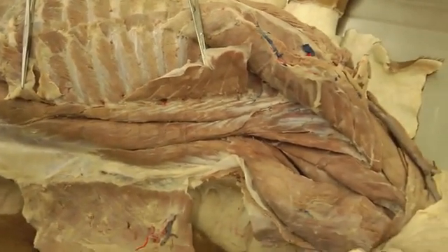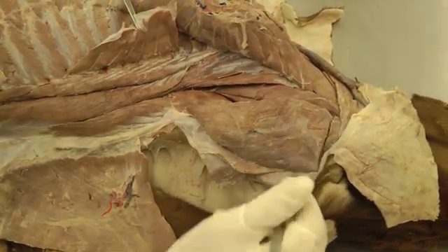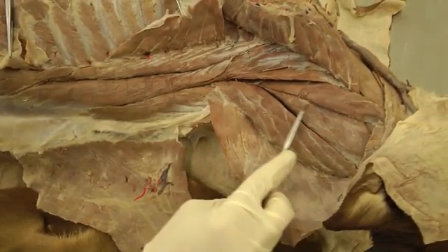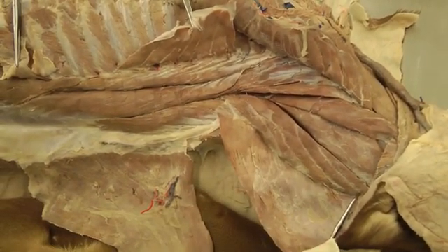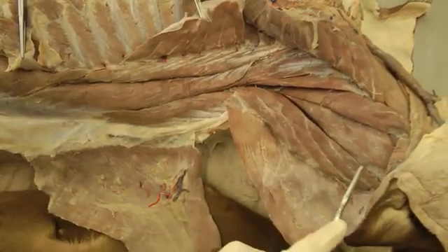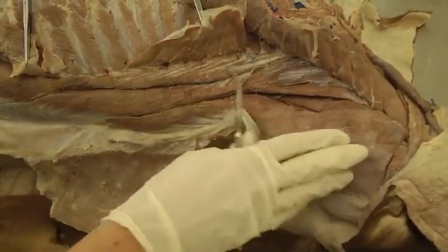Then we have the transversospinalis system. We talked about splenius, which is this top part right here — you'll want to isolate the border and then cut splenius, making a cut across transversely and flipping that up towards the midline. Then we have semispinalis capitis, which is this whole muscle body here. Semispinalis capitis is broken into two parts: biventer cervicis, which is the dorsal aspect, and complexus, which is this muscle body — making up semispinalis capitis, along with splenius, as our transversospinalis system.